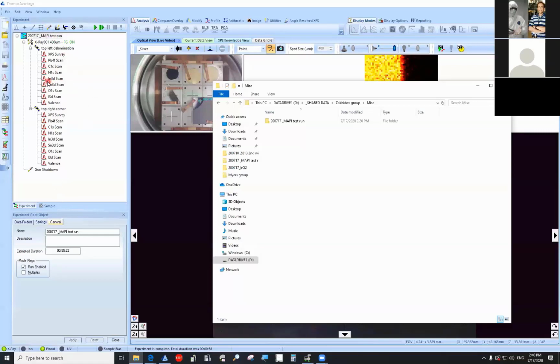And then finally, the last data type. We talked about VGX for the experiment, VGD for the actual data or scans, including pictures. The last type is a VGP, P as in Peru. That saves all of the metadata associated with this process, and can also save all the bulk scans together in one file. So if you're trying to send something and you don't want to send somebody 45 scan files, you can lump it all up into that VGP file extension, and that'll keep it all nice and tight for you.